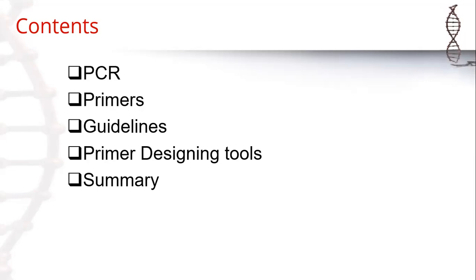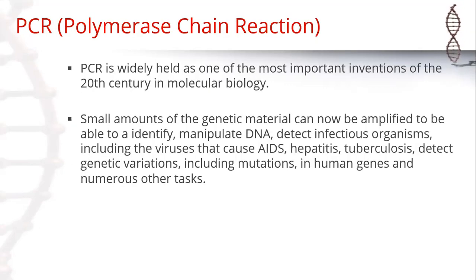And then we will discuss the primer designing tools which are available online or which we can also download to design the primers. At the last in this lecture, we will discuss a brief summary of these lectures, and then we will go to the online tools for designing the primers. The first is PCR, polymerase chain reaction.